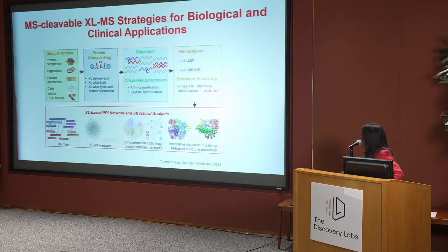So the strategy we have developed allows us to do different types of applications. I showed you mostly examples studying protein complexes, and we can also study different organelles. In collaboration with Arun's group at UCSF, we also study the surface proteome to understand the structure of the surfacome.